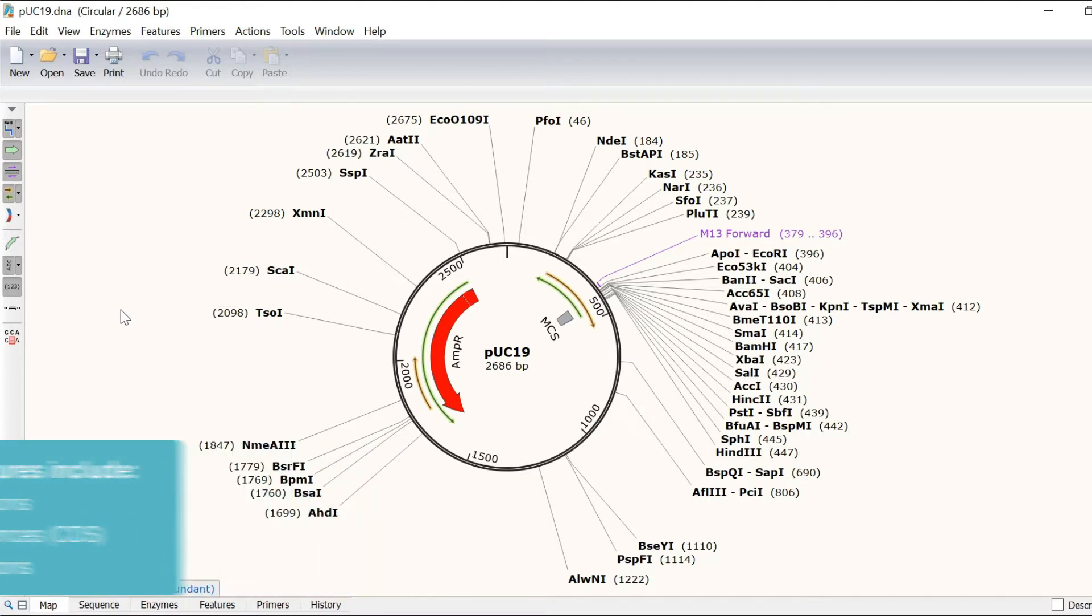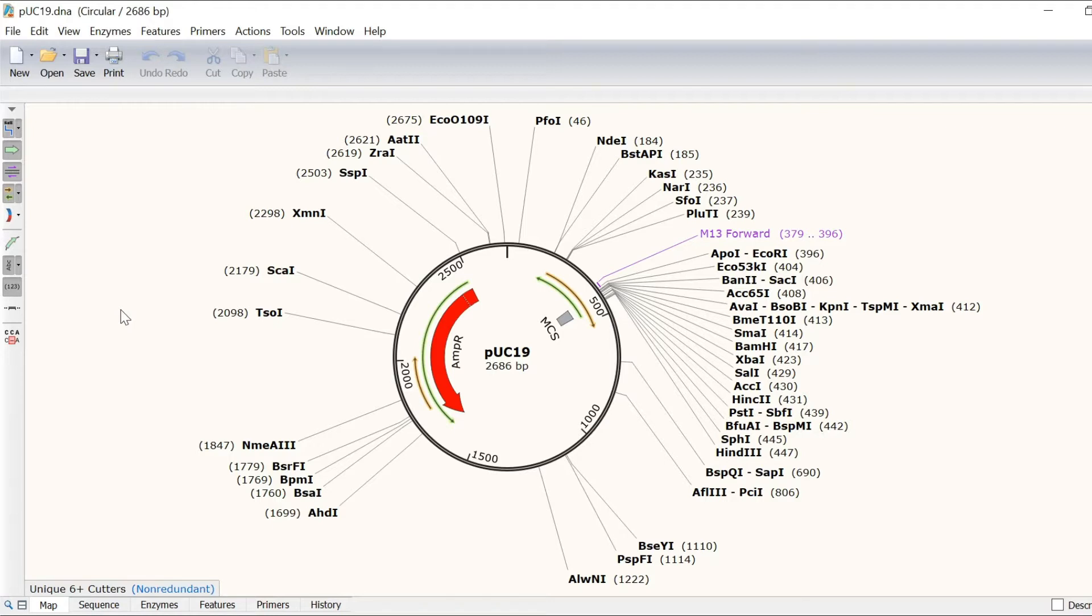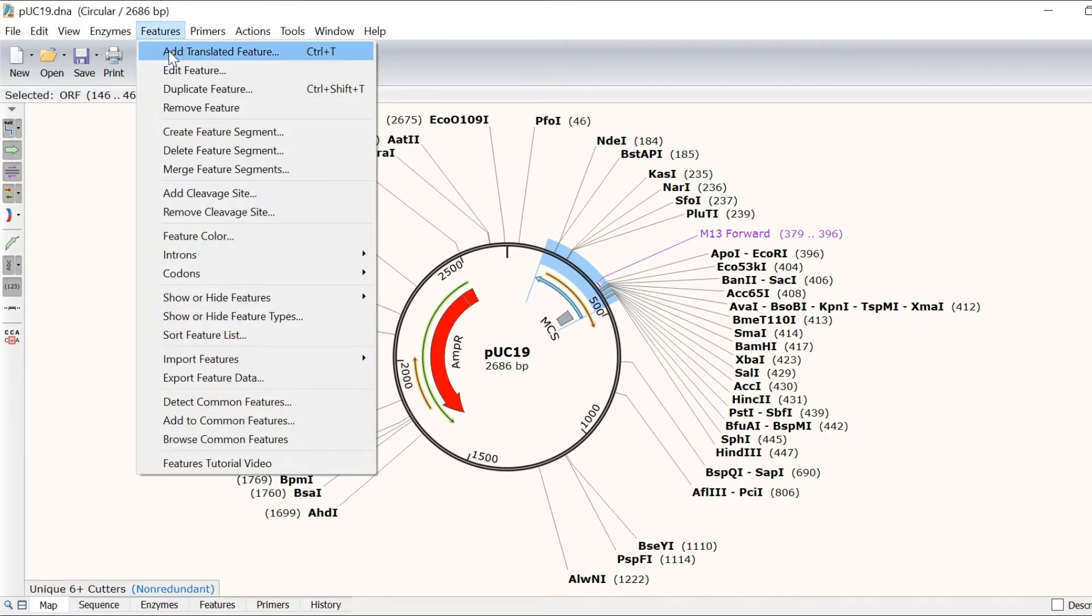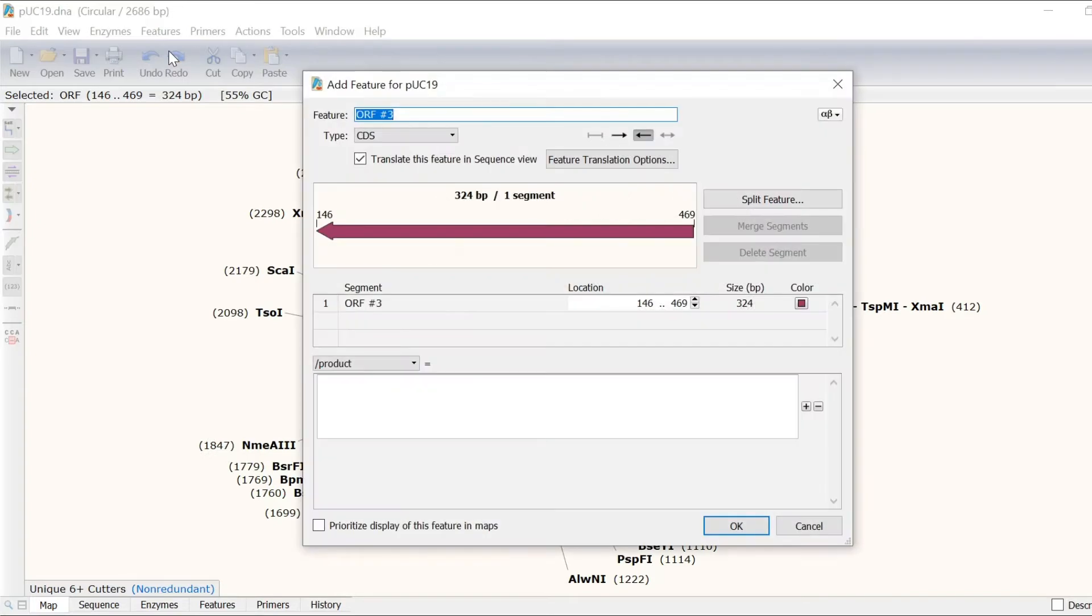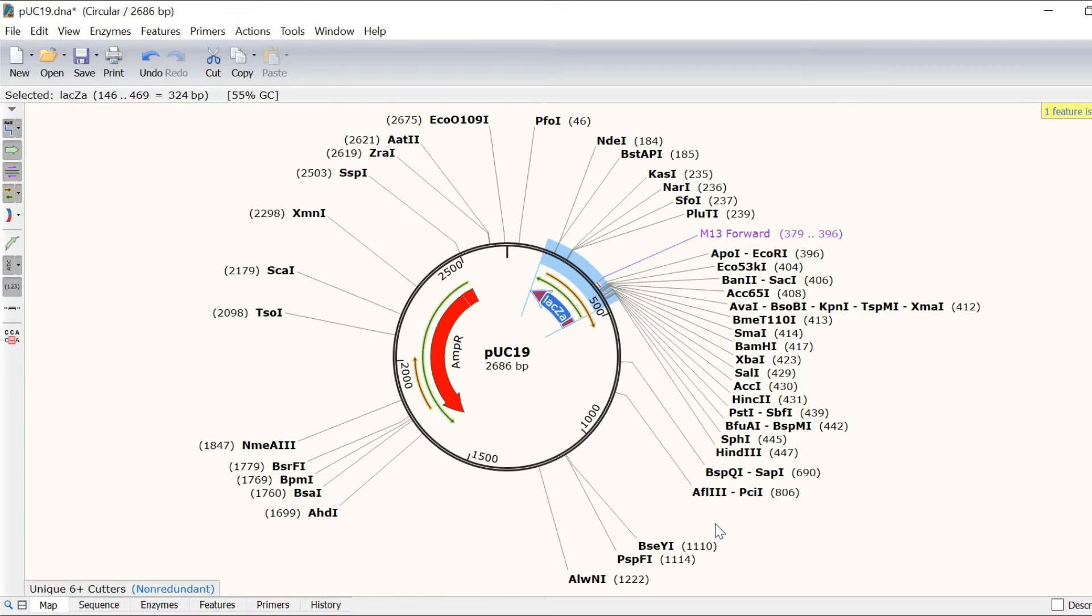But features can also be added manually by simply selecting or highlighting a region of interest. For example, I will annotate this open reading frame as a feature by selecting it and going to features, add translated feature. I will call this feature LACZa since it codes for the LACZ alpha fragment of the beta galactosidase gene.